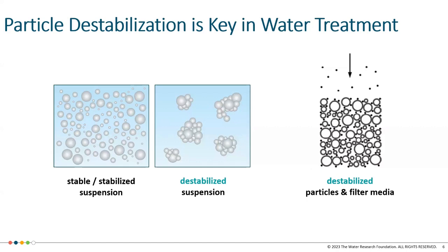So in situations where the sufficiency of particle destabilization is challenging to assess, zeta potential analysis can be especially impactful for ensuring well-operated treatment. And that is one of the things we found especially useful in Water Research Foundation Project 5110. And all of that coming together is discussed in the last module, which is Module 6 of this series.